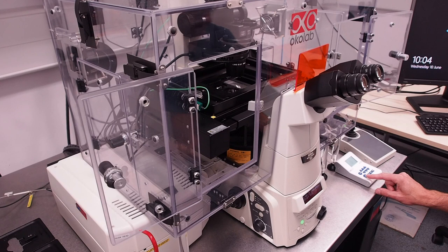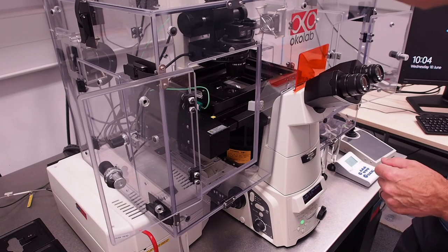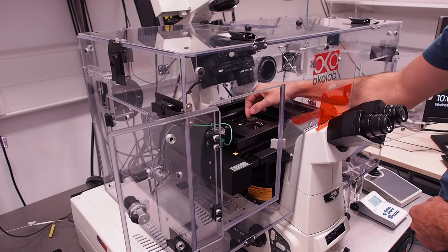This video shows you how to shut down the Nikon A1R confocal microscope at the centre for life and clean an oil immersion objective. Once you have finished imaging your sample, tilt the condenser arm back and carefully remove your sample from the stage.